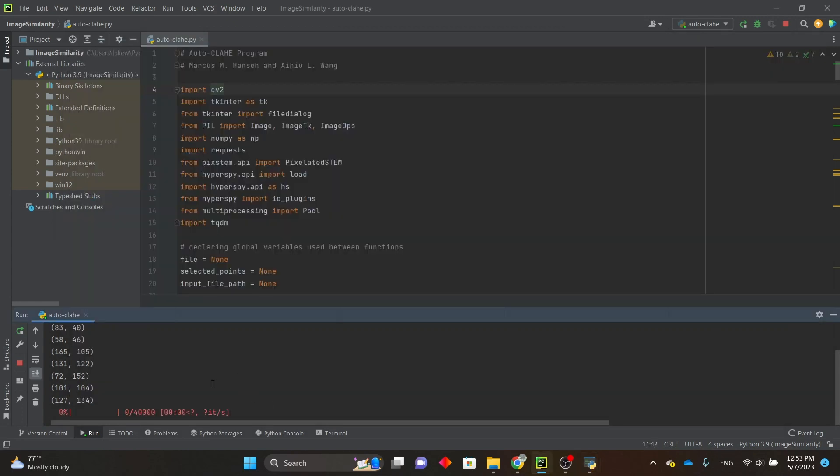Once it's done filtering, the enhanced data set will be saved to your computer as a new file. It'll have the same name as the original data set, but with AutoClicky appended at the end.